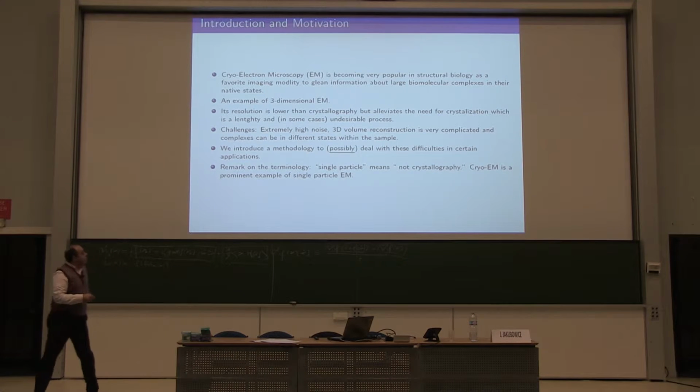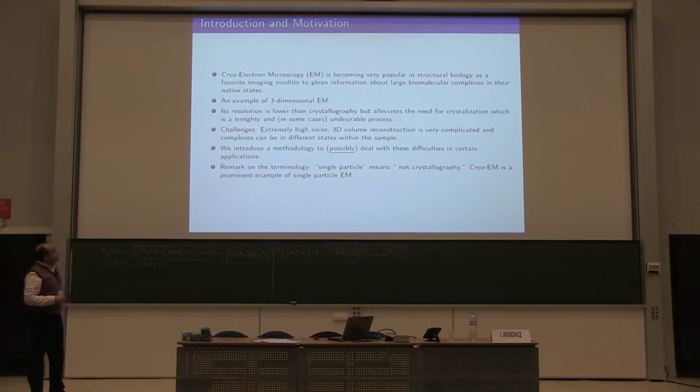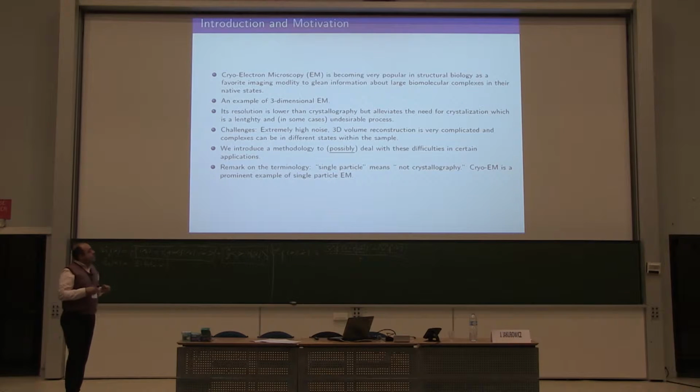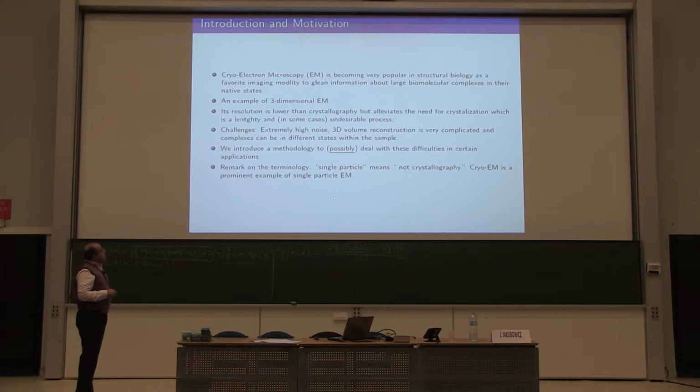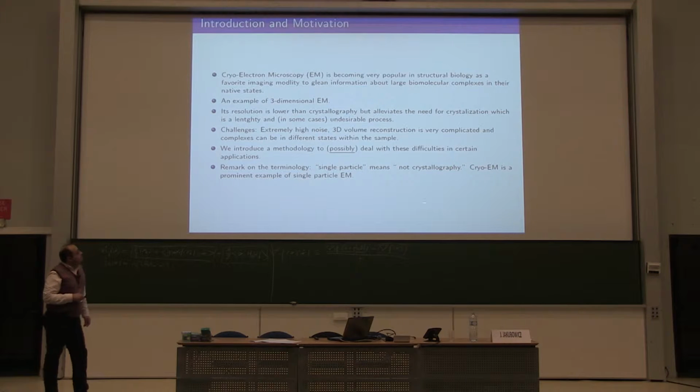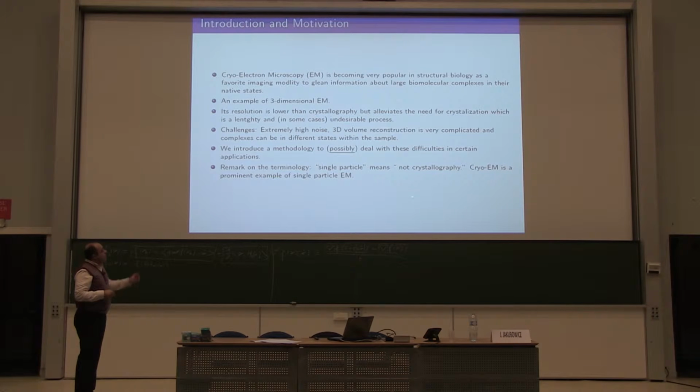The term single particle usually refers to anything that is not crystallography, because in crystallography you have basically a network of molecules aligned together, but here there is only a single molecule. There is no arrangement. And cryo-EM is a specific class of single particle imaging, which my talk will be about. And I will explain briefly what cryo-EM is exactly.